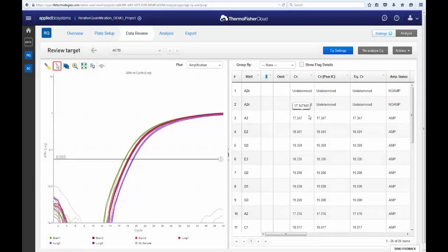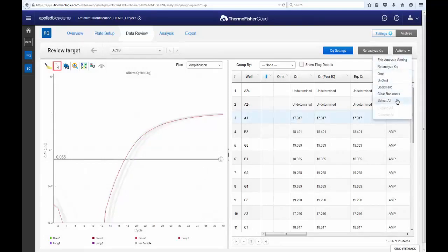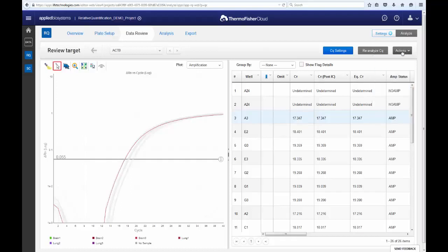You can also omit data points that you feel may be a result of error. When you are confident of your settings, proceed to the Analysis tab to view the end results.